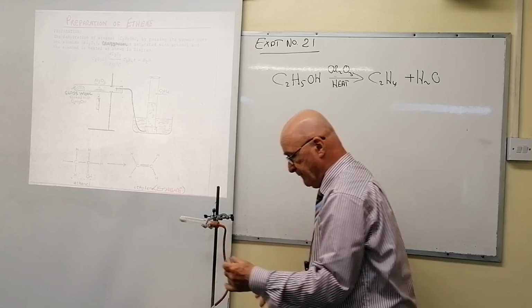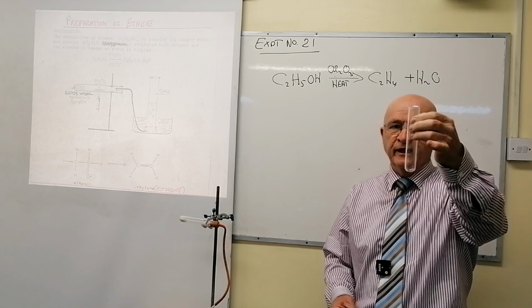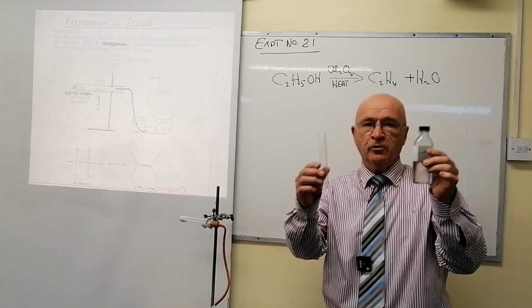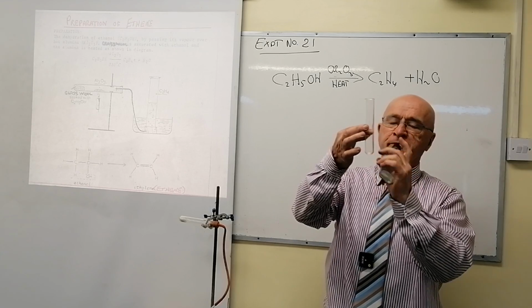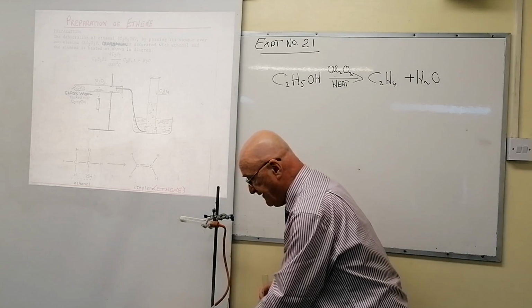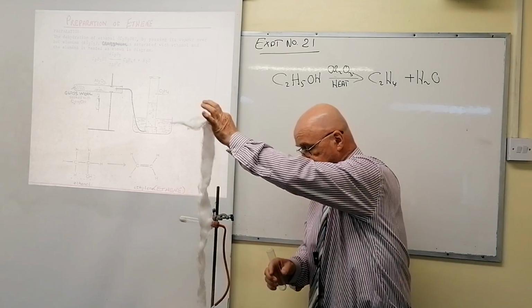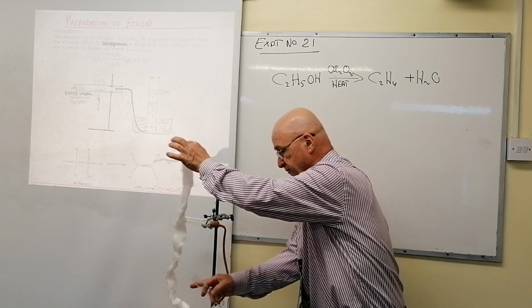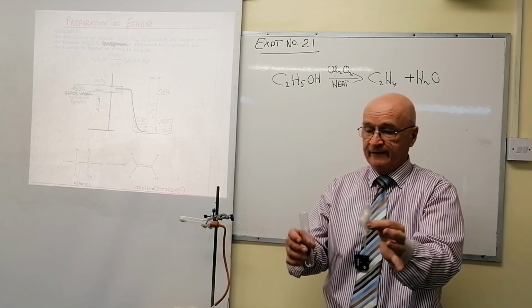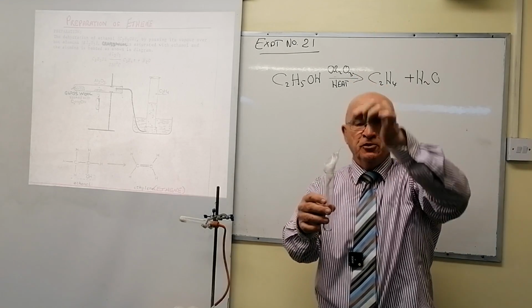For a few reasons. Basically, you take a boiling tube. That's not a test tube now, a boiling tube. It's a large test tube, okay? And you put some alcohol into it. You pour the alcohol into it to about 2 centimeters deep. And then what you do is, you take some of this, which is glass wool. Glass wool, okay? And you notice the way in which I'm handling it. That's what the rubber gloves are for. It's fiberglass. And you put it in here, and using a glass rod, you push it down.